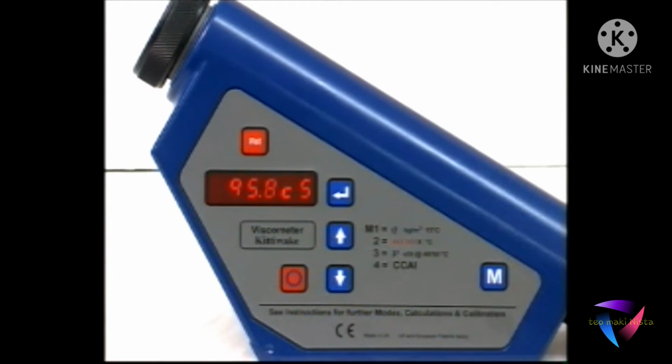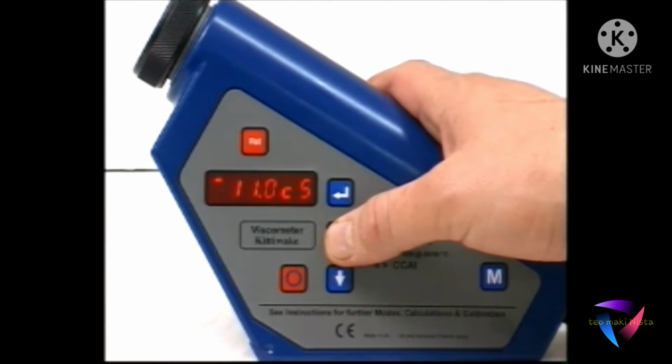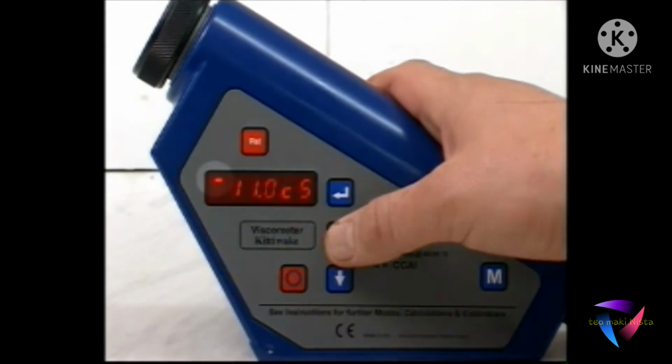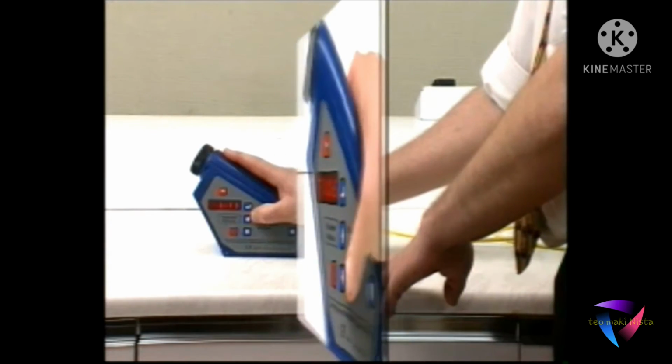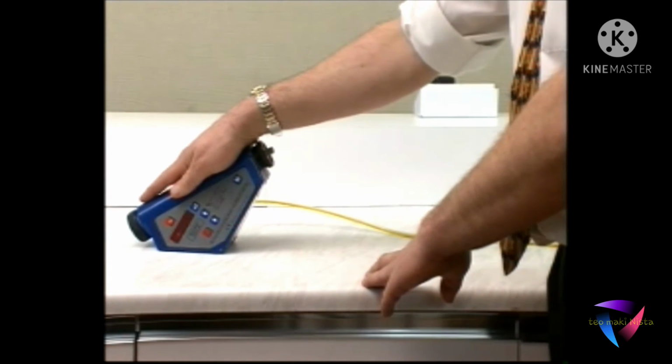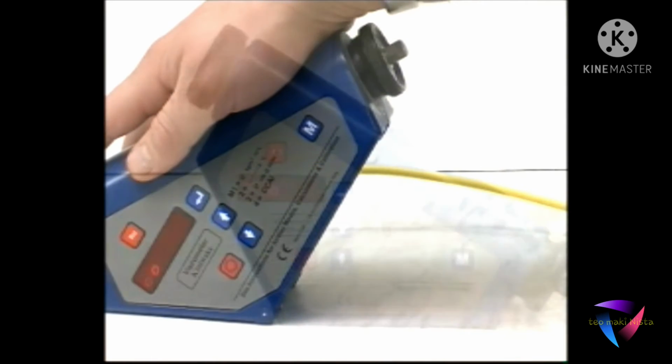Use the arrow keys again to get a display of centistokes at 100 degrees Celsius if required. This is indicated by the small dash on the display. To improve accuracy, take several readings over a longer period of time until the readings stabilize.